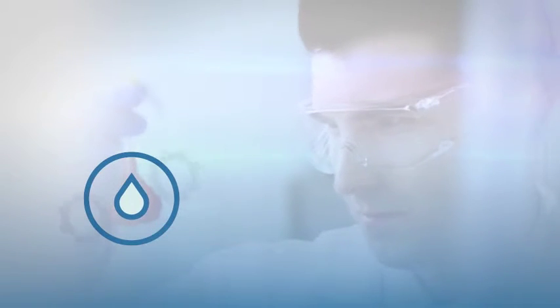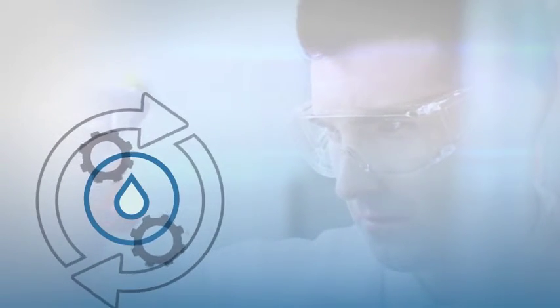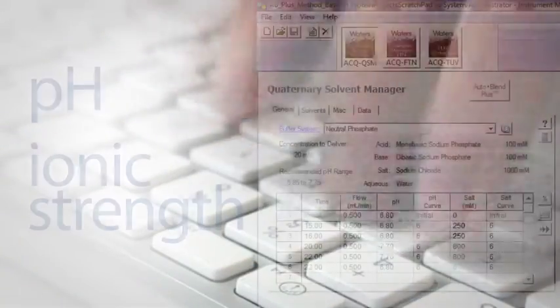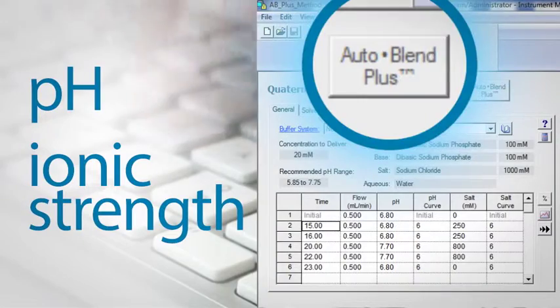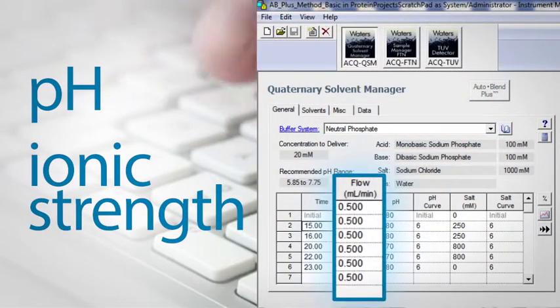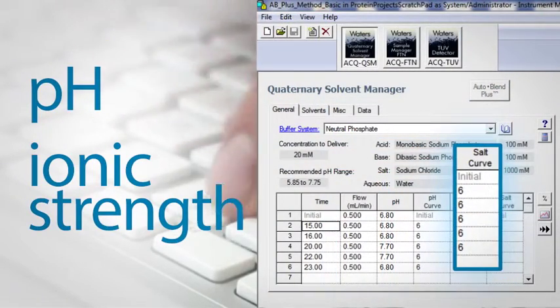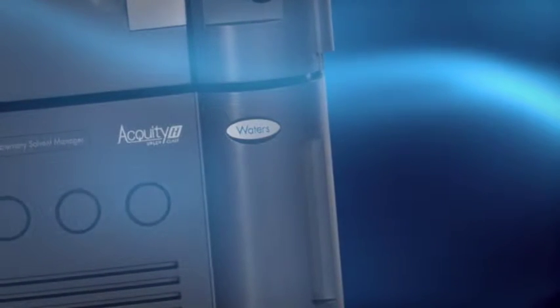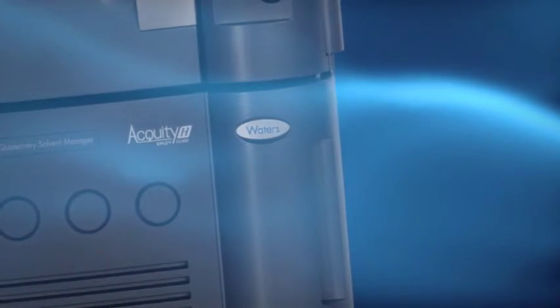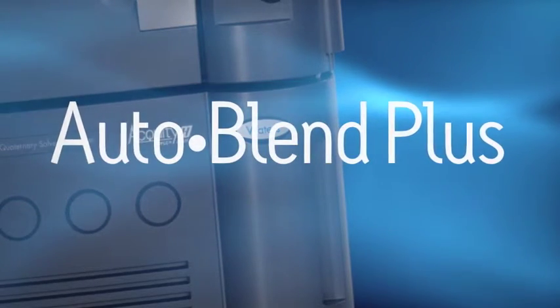Chromatographers, there's a powerful force for your lab. One that gives you unlimited access to separation space without cumbersome manual manipulations. One that lets you program your LC to create mobile phase compositions at a specific pH and ionic strength. One that makes it easier than ever to get the best analytical method for your sample. This force is Auto Blend Plus.